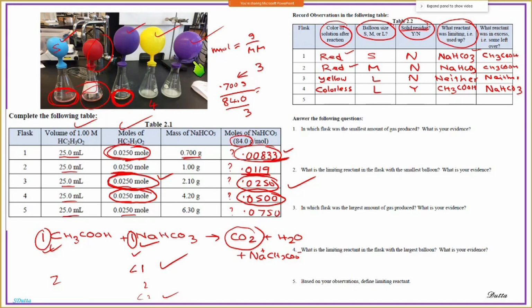and that can be justified using a principle called Le Chatelier's principle, which unfortunately you're going to learn in 1160. That is the difficult part in chemistry. Sometimes if you want to go a little bit deeper, you require more knowledge, which you're going to learn later. Based on the knowledge you learned so far about the limiting reactant, if I increase one of the reactants, like here, after the mole ratio 1 to 1, if this one is limiting, it doesn't matter how much sodium bicarbonate I add. I can add 1 more gram into the reaction mixture, but the amount of carbon dioxide is going to be the same.